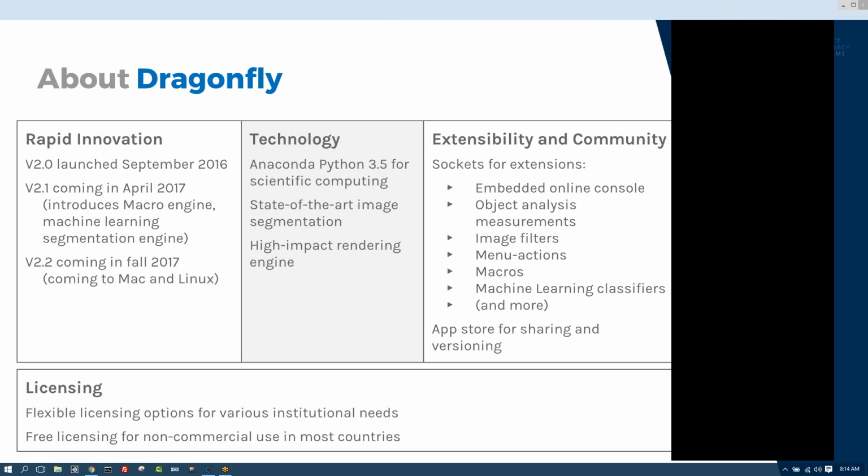Right, so we run on Windows 7, Windows 8, Windows Vista, and Windows 10. We run on Windows 7 and up. I happen to be running on Windows 10 right now. We only build for 64-bit, but that's because we have absolutely no demand from any of our customer base. None of our customer base working with 3D data seems to be working on 32-bit platforms. So any Windows 64-bit from Windows 7 and up is fine.